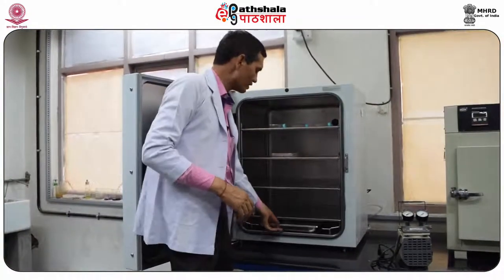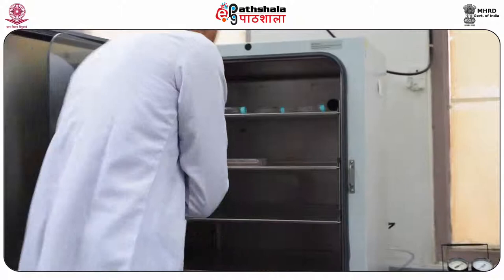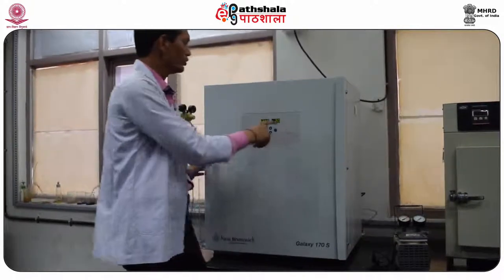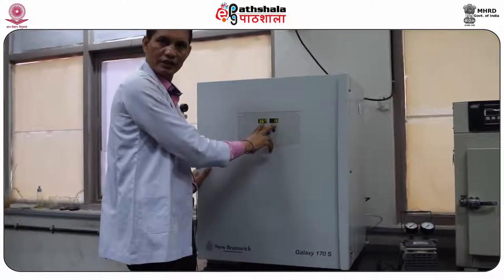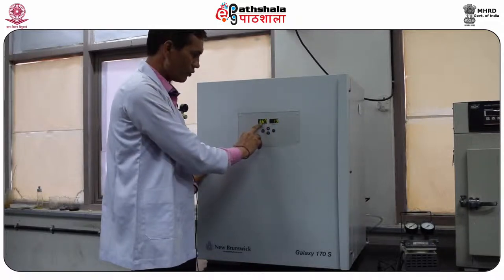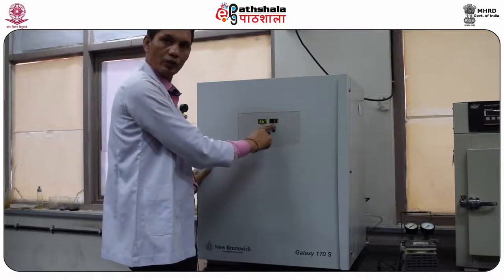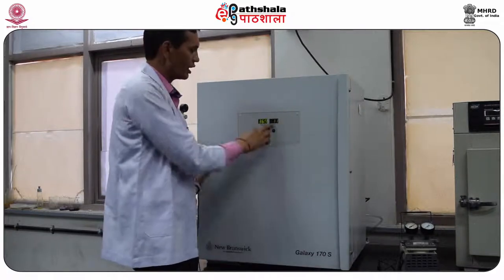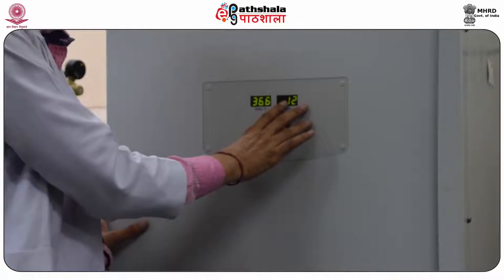Another factor is the humidity, which is maintained by the tray which contains clean water. It contains many sensors. It gives a sound when these parameters go down from your settings. When we open the door, the temperature comes down slightly to 36 degrees, and the CO2 level comes down to 1%, as the stored CO2 diffuses into the environment. Therefore, the alarm starts when the parameters go down from the requirement of the cells.